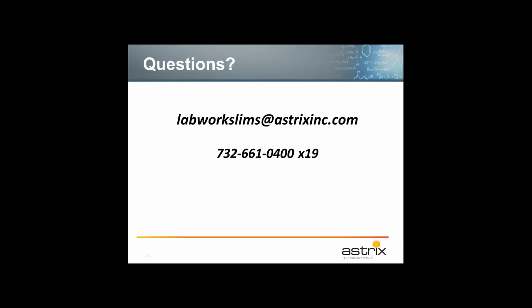Crystal is just the newer technology. It allows a lot more possibilities. But again, there is a learning curve there. But those would be your four main types of reporting within LabWorks.